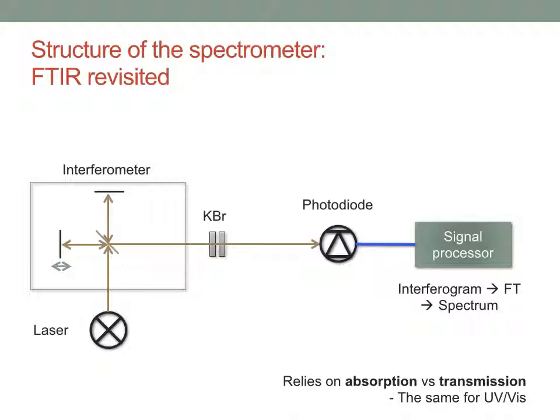The signal I get out needs to undergo Fourier transform, which is why we call them FTIRs. I'm not going to go into any of the Fourier transforms. Some of you that have perhaps done natural sciences will have seen Fourier transforms. The point of it is that I end up with a big mess of a signal, essentially, but that there is a single solution to it, which gives me the spectra. That is the only possible way that I could get that particular big mess of signal. So I'm just going to refer to that as a magic piece of maths. It's a very clever piece of maths, but it's essentially the same way as an NMR works. I get a big mess of signal, and I have to use a Fourier transform to deconvolute the data that I have.